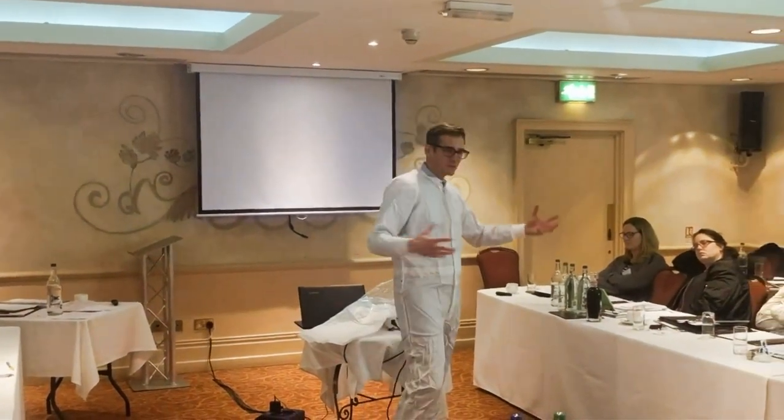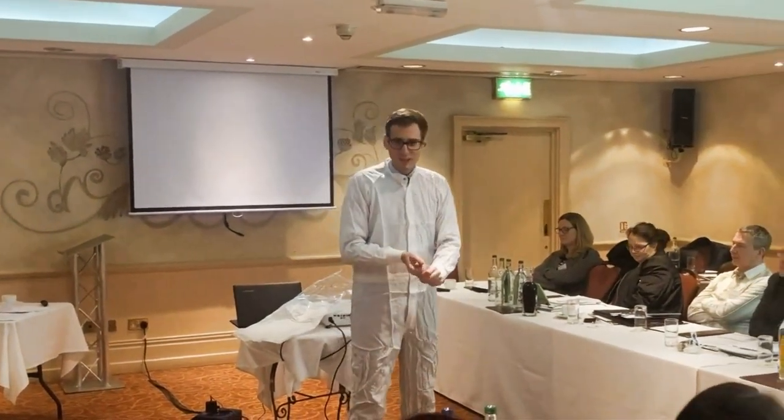So it's up to you which technique you want to apply now. We prepared some overalls outside where we have a bit more space and better air to breathe, in maybe smaller groups, and evaluate the best practice for aseptic gowning.